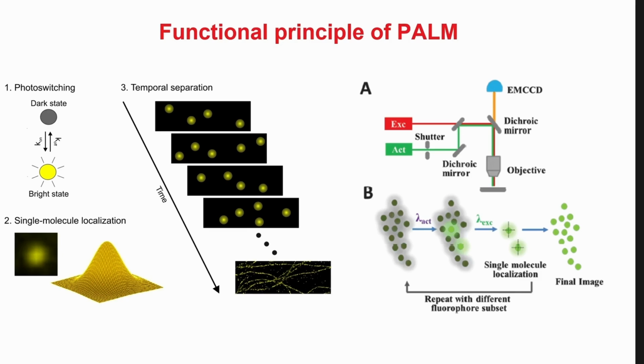And what happens if you do that? Well, if I see one molecule and I record the fluorescent image of one molecule which is sitting by itself, no neighbors, nobody is flashing, everybody is dark, then I can detect this distribution of intensity from the molecule, and I can increase my pixel resolution, so I can increase my pixel size, so that I can resolve this very nicely.